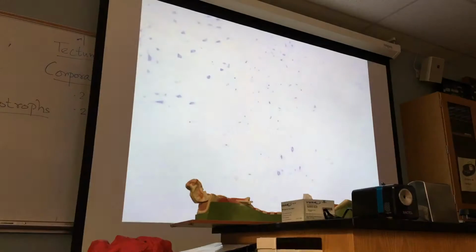You can see all the cell bodies and some parts of the neurons. These are all cell bodies. And this has been prepared for staining the organelles, or the parts of the cell that contain RNA.